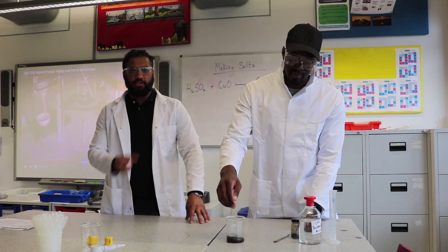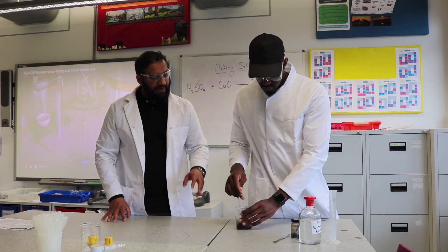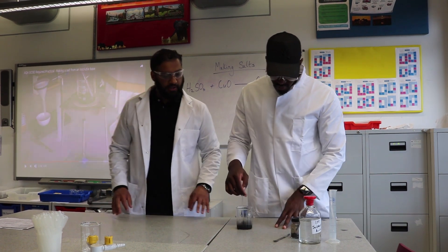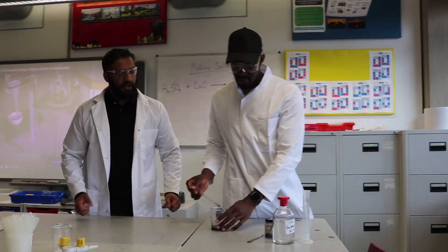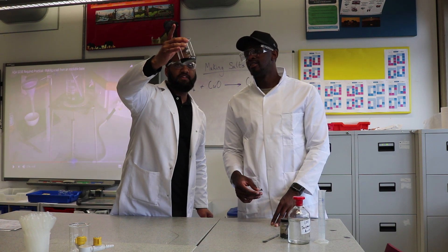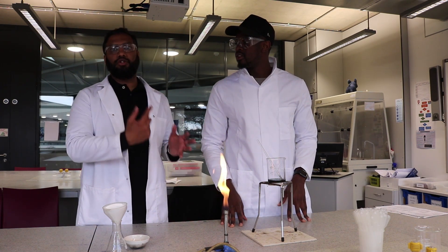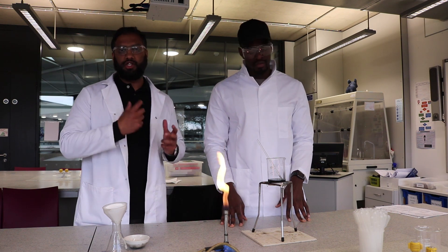As he's stirring, he's mixing the sulfuric acid with the copper oxide. Once mixed, you might be able to see a tinge of blue. We can also look at kinetic theory here — all the particles are moving around, bumping into each other and colliding, which speeds up the reaction.